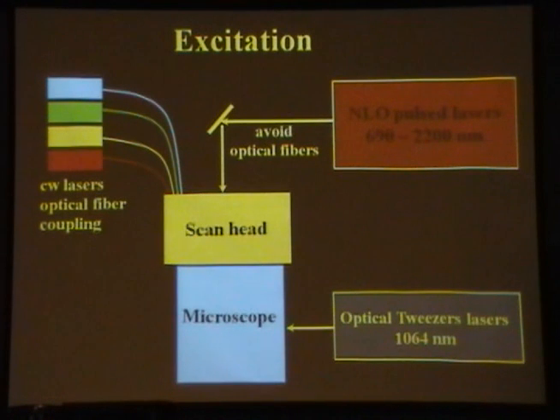And for these lasers, you don't want to use fibers. Fibers will spread your pulse and you're going to lose pulse width. And then optical tweezers, you're going to bring from the sideways, the first thing before your objective here.